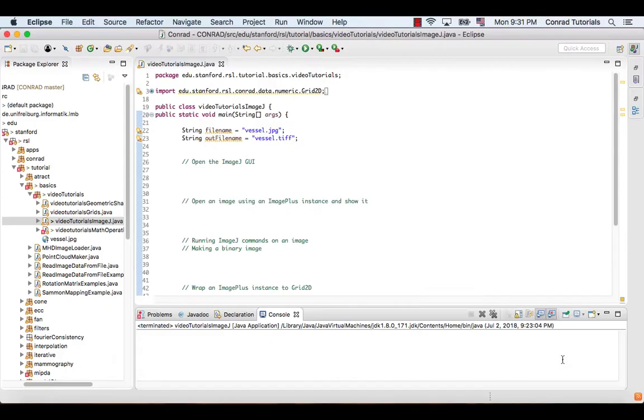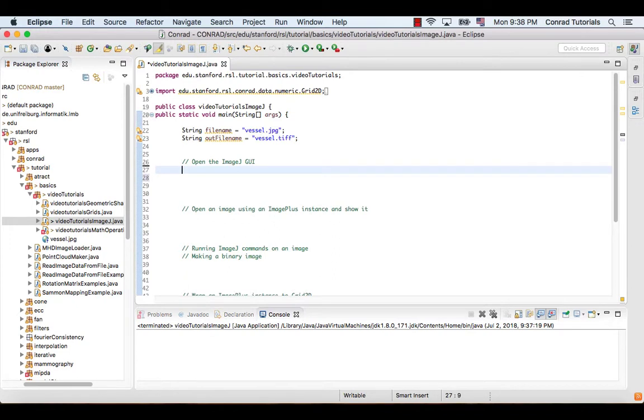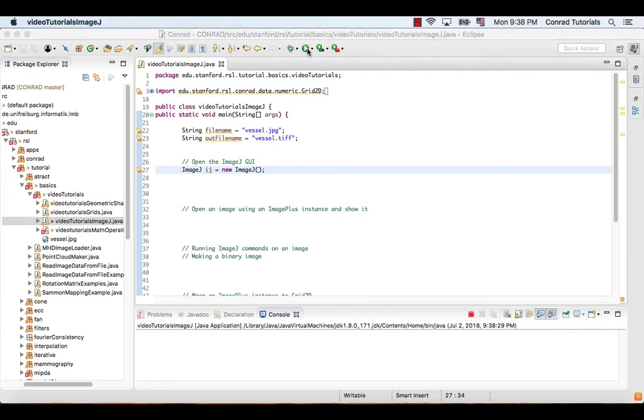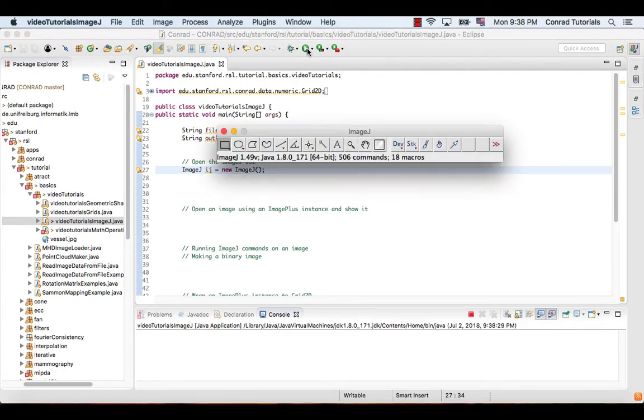To begin with, it is very easy to open the ImageJ interface in Conrad. We can simply create a new ImageJ object by calling its default constructor, ImageJ. As we can see, the ImageJ interface appeared.